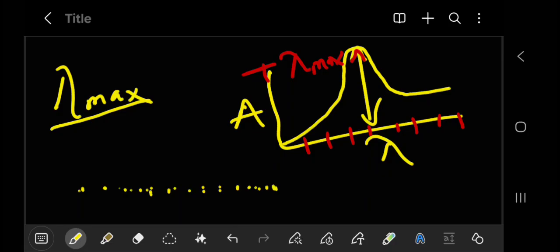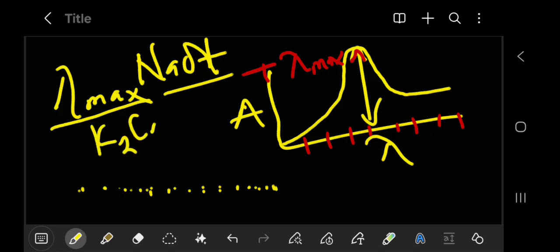And meanwhile, let me not forget, in your manual you also employ the use of sodium hydroxide. Like I said, you need to know why these things are used. You made use of this for the preparation of various concentrations of the potassium tetraoxochromate(VI), K2CrO4, solution.